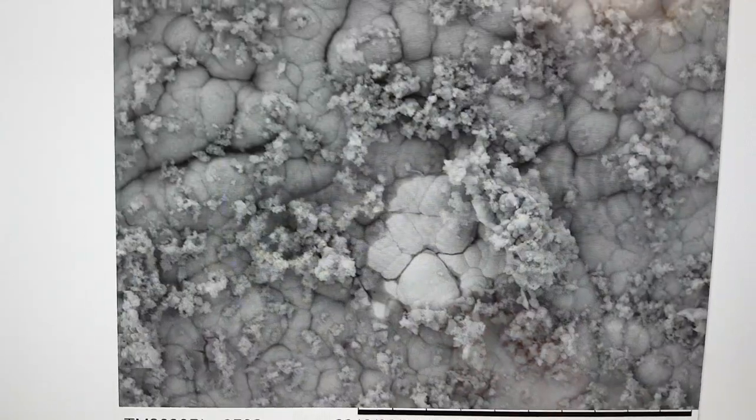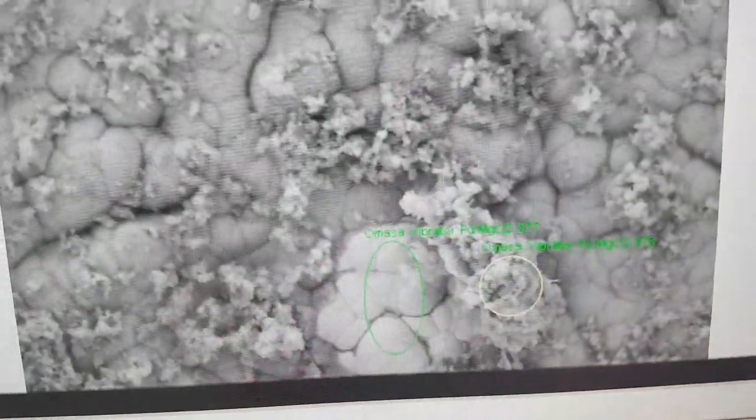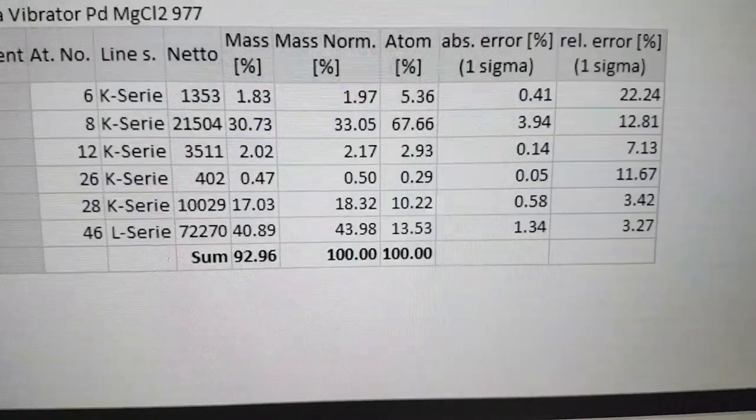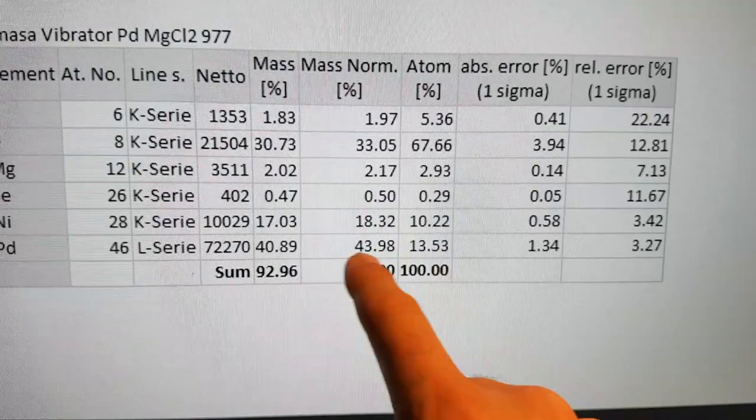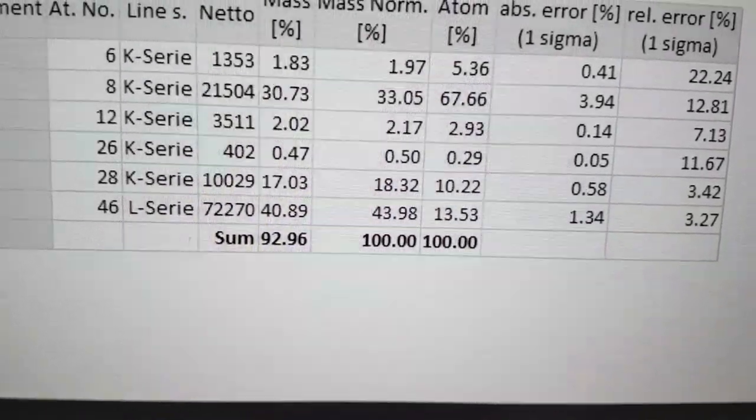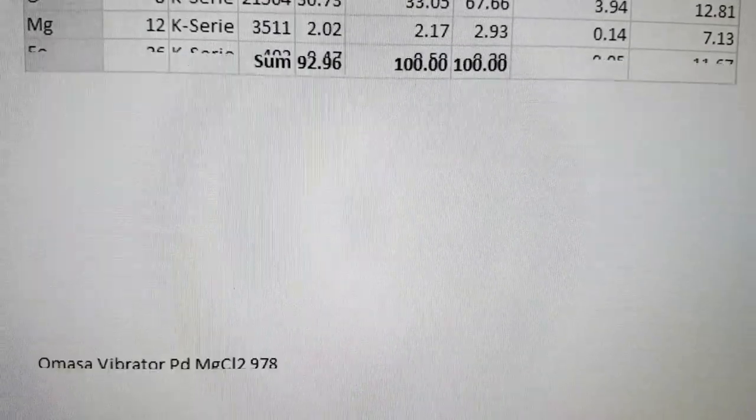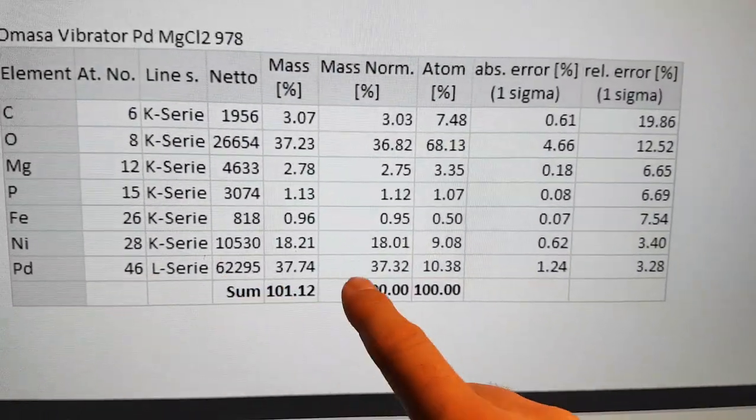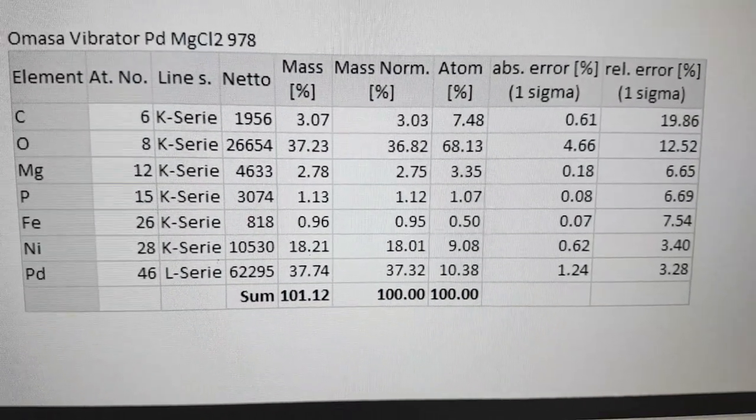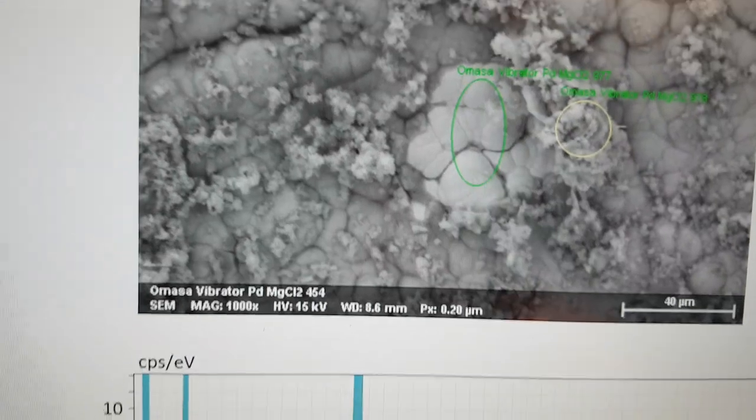I will take you to the next image. This one's not so interesting, just a hot spot there. Now this one is just showing kind of like a bubbly area and I thought I'd have a look at that and see what's going on there. I've got two sample points here. This clean area has got 43.98% palladium by mass. This looks basically like clean palladium.